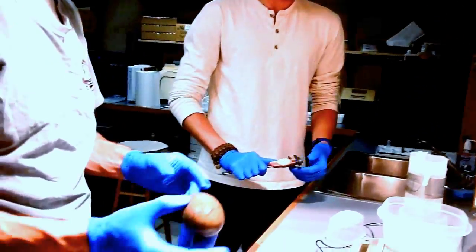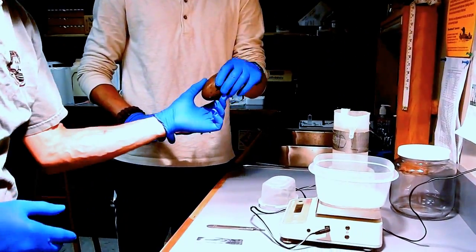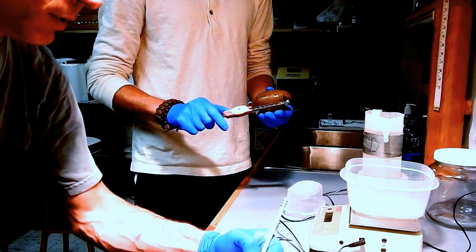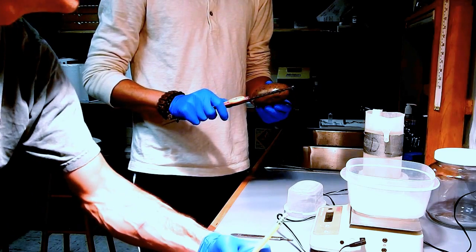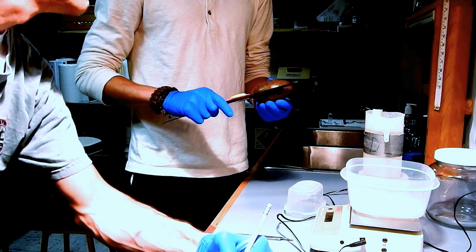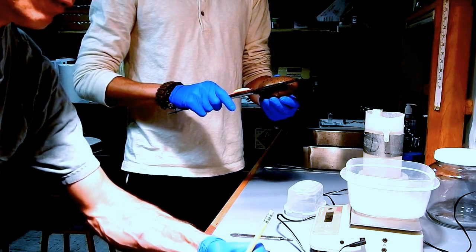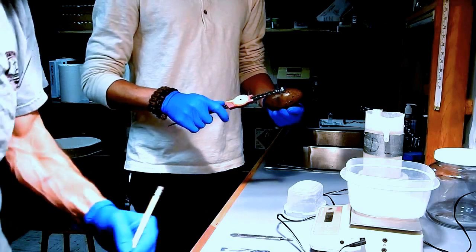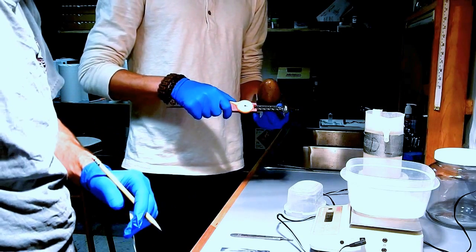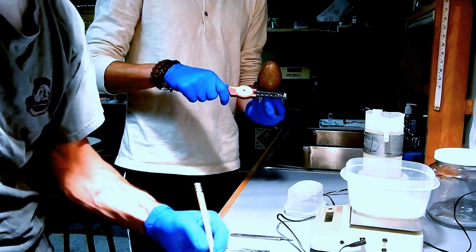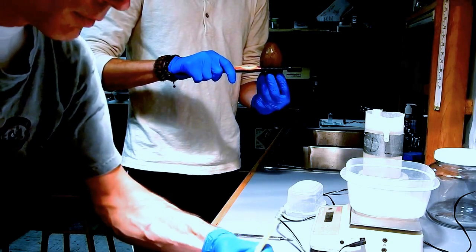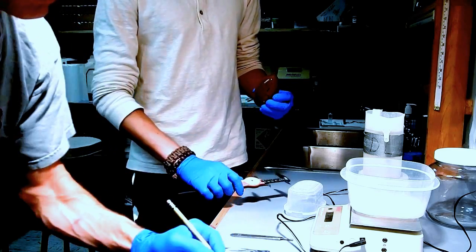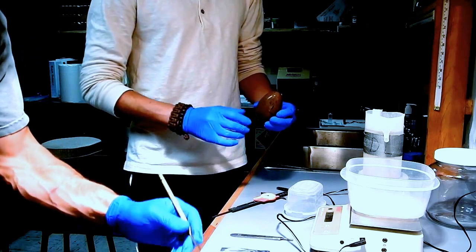So here's the egg. The first thing we usually do is we'll measure it with the calipers. We'll take some length measurements and some width. So first here we'll do the length, which is 97.2 millimeters, and the width is at the widest part, which is 56.6 millimeters.